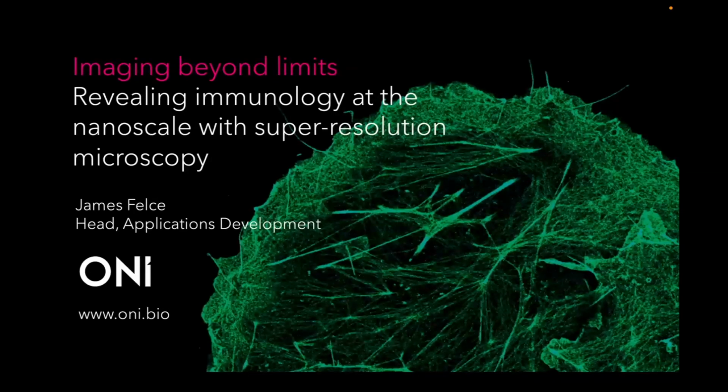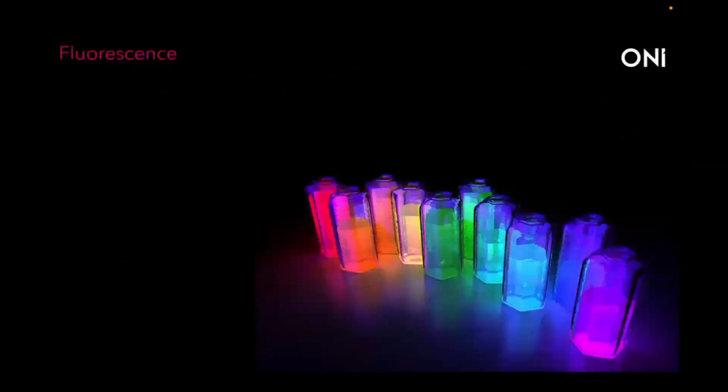So I'm going to start with a bit of a broad overview of fluorescence microscopy. Apologies if this is a bit basic for some of you who might already be familiar with advanced imaging, but just to make sure that we're all on the same page. Fluorescence is a term that most people are aware of, and most people have an understanding of how it might be used within immunology. It can be used for imaging, but also for flow cytometry, which has underpinned an awful lot of immunology, as we all know.